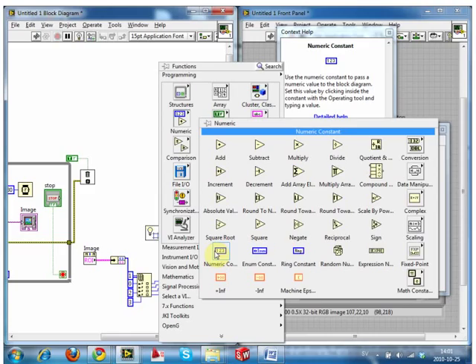Because you define the rectangle with 2 points. It's always defined with 2 points. Yeah, but what if, for another application, it was a pentagon? Then how many constants would you put in there? No, because this is a rectangle. Yeah, but what if it was not? Well, if you need to define 5 different points, how many constants would you have there? Well, you won't be able to use that function because this only pulls out a rectangle.